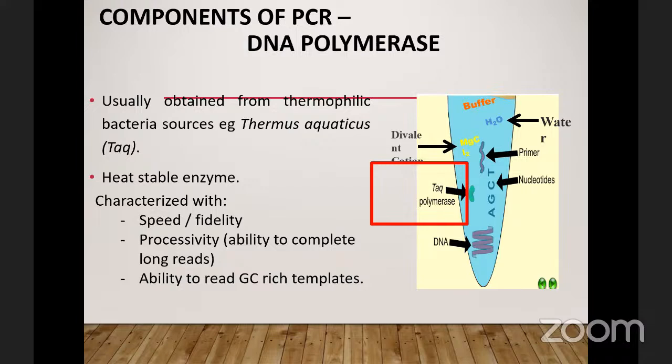Okay, that's sorted. Now, DNA polymerase as an enzyme, from the name polymerase, we know that we have to selectively get a kind of DNA polymerase that can stand that kind of increase in temperature without being denatured. Enzyme activities, we know they are affected by temperature.